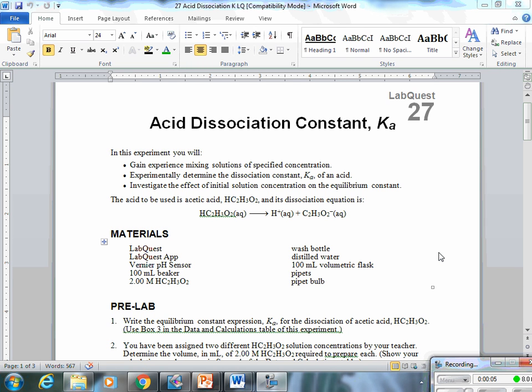Braun. Today we're going to talk about computer lab number 27, acid dissociation constant K sub A. In this experiment, you will gain experience mixing solutions of a specified concentration. I'm going to give you a specific concentration, and you are going to need to make that concentration.